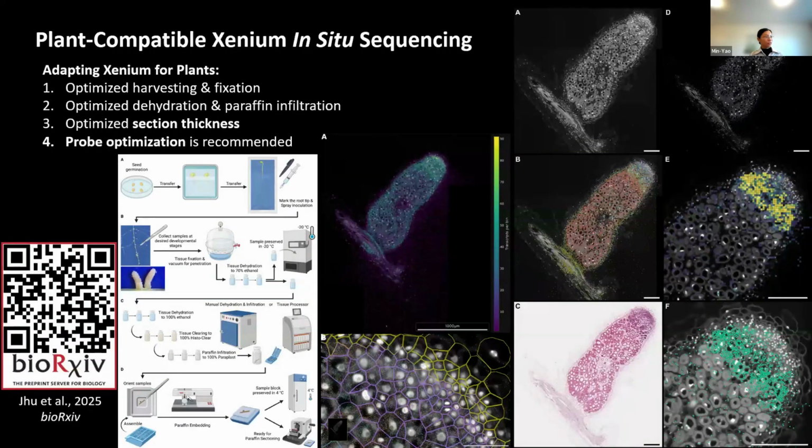So today I just gave you a short summary and a snapshot of the process we used to apply the Xenium approach to our specific tissue type, and also the optimization process that we used in this first trial in the Medicago tissue.